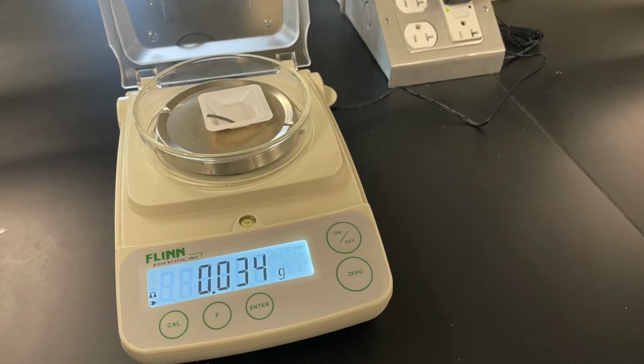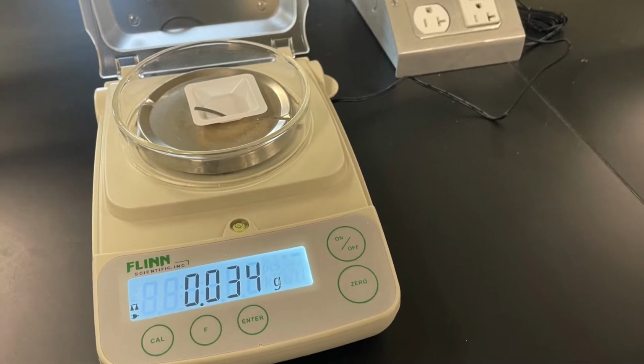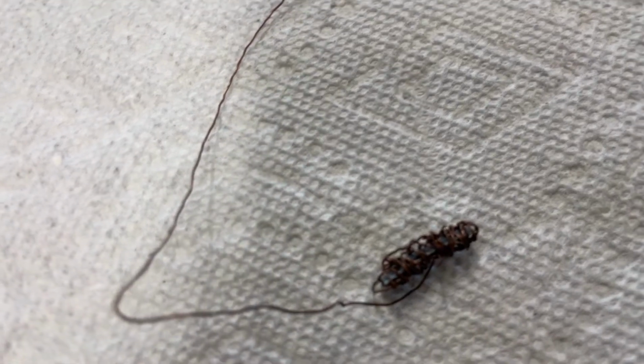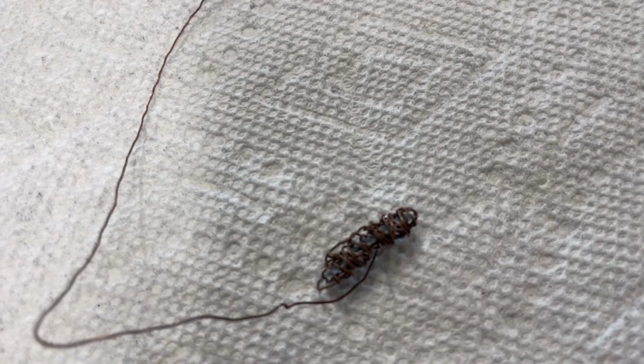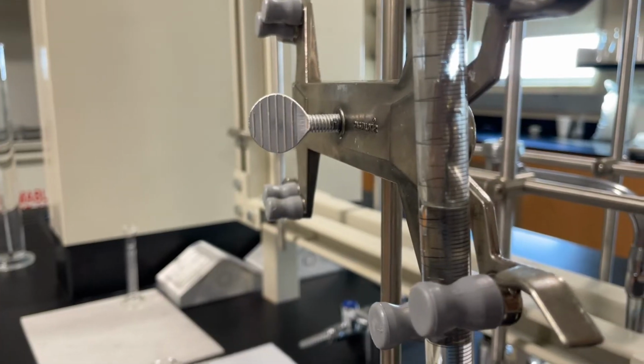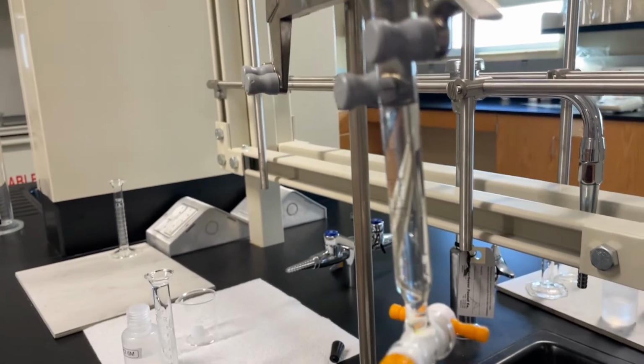Begin with measuring a sample of magnesium. We wrap our magnesium in our copper wire, but with a small enough diameter that it'll still fit inside of our burette. We check just to make sure. We go ahead and add 10 milliliters of 6 molarity HCl to our burette, then we fill the rest with water.